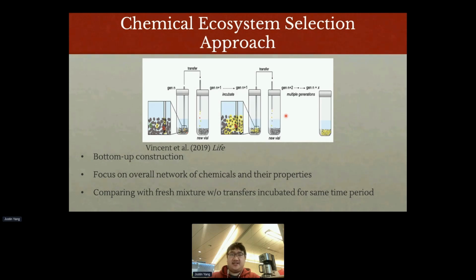That one process of transfer and incubation we define as a generation. And to see the effect of this lineage and history, we compare it each time with a fresh mixture without any transfers or prior history that's also incubated for the same time period.